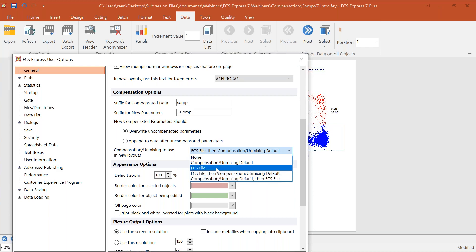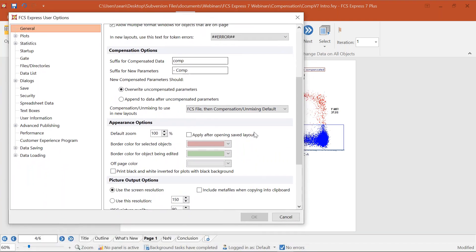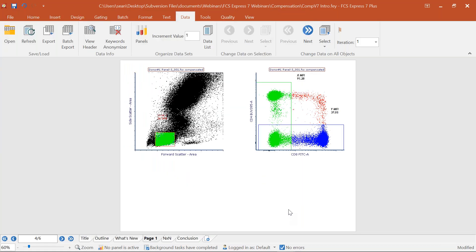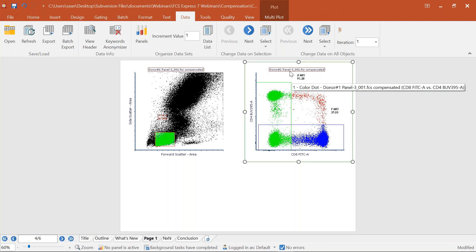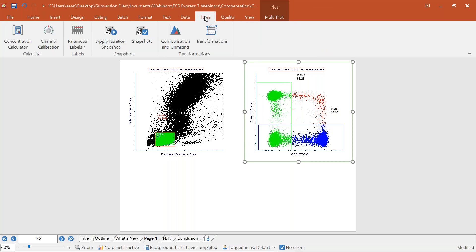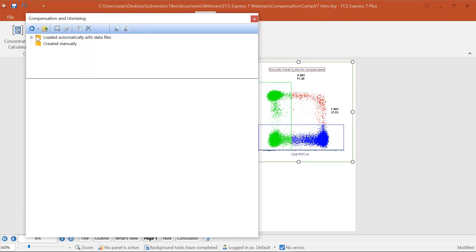You can also force FCS Express to use an FCS file compensation, a compensation default, or no compensation at all. We'll be leaving these options at the default for now, but when we come back to the compensation default you'll understand where this is defined. Once a data file is opened in FCS Express and you see it says 'compensated', you can access all compensation information in the Tools tab under Compensation and Unmixing.